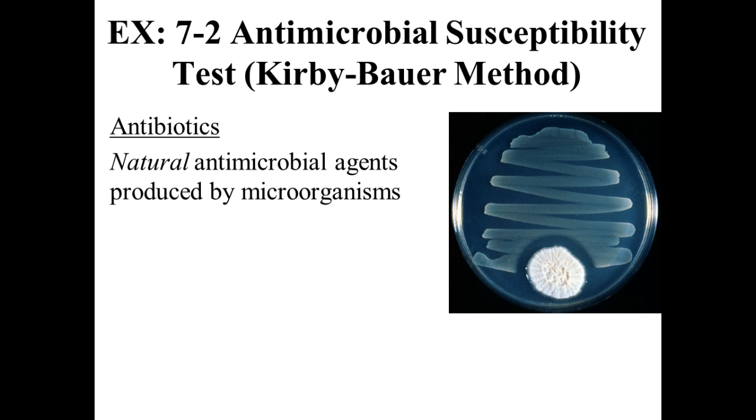So this is chemicals that they've been producing, as you see here in that plate. This is a natural thing that happens. We've basically just stolen their technology, right? We've stolen their chemicals and used them externally. So microorganisms actually produce these to fight other organisms. And they're fighting over space and food availability. The same things people fight over, right? We're not all that different.